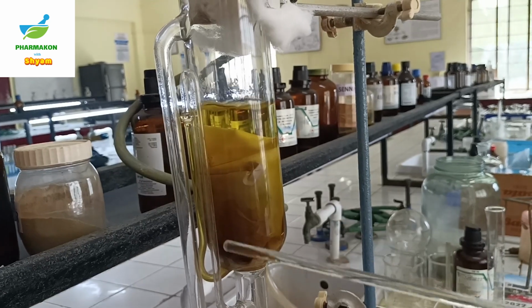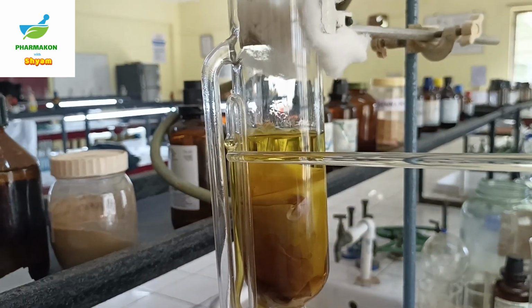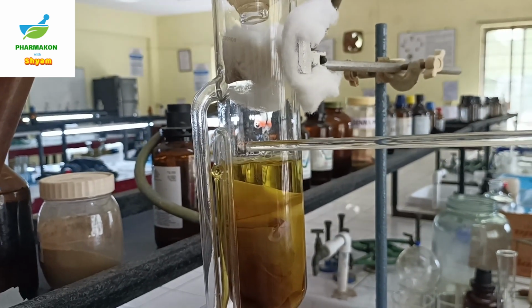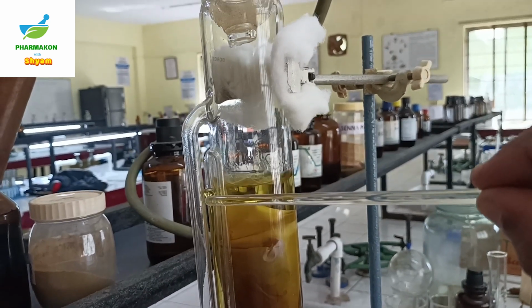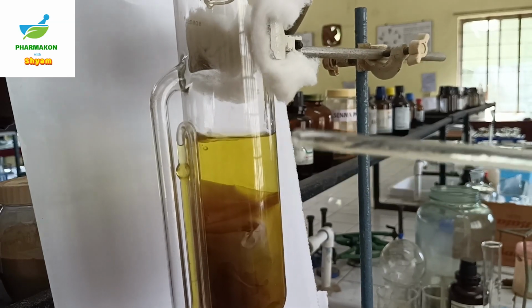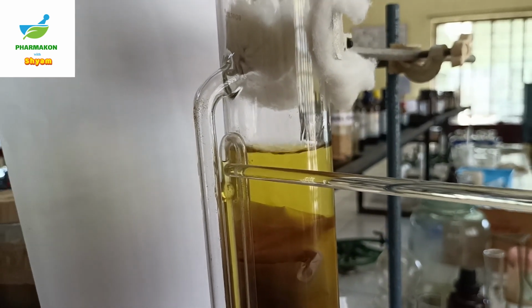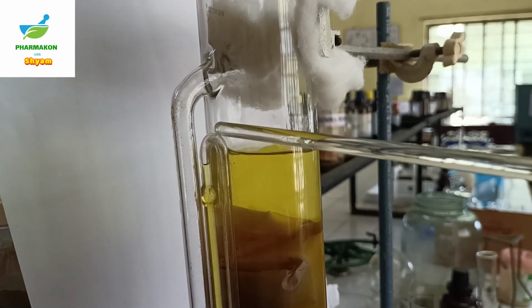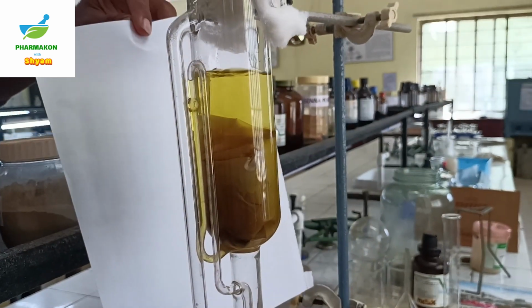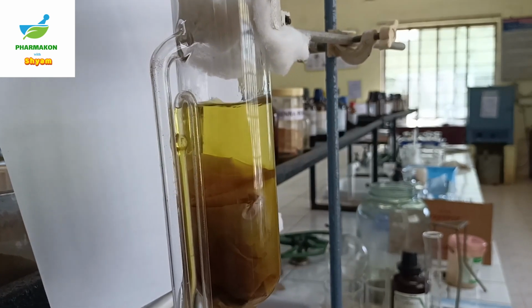The solvent has risen in the siphon tube and has reached the bulb of the siphon tube. So the level of the solvent in the extractor is rising up, and you can see the solvent level in the bulb brims up above the bulb. You can see the solvent in the siphon tube is about to rise, and it is ready to fall back into the round bottom flask. Let us wait for the solvent to rise up and fall back into the round bottom flask.